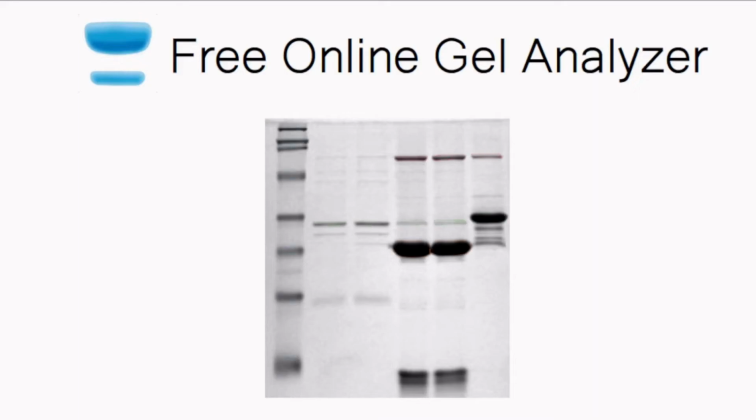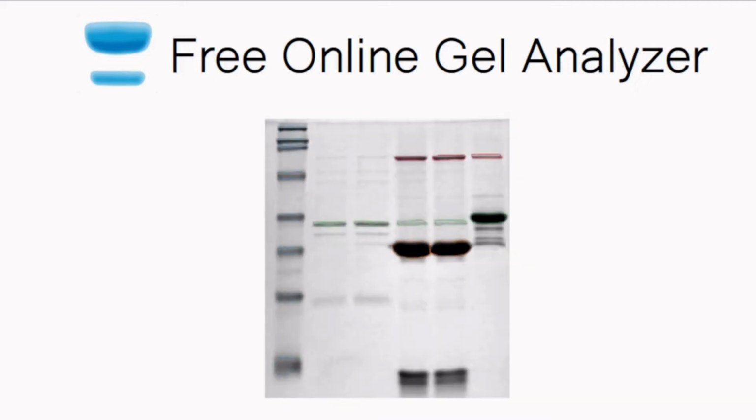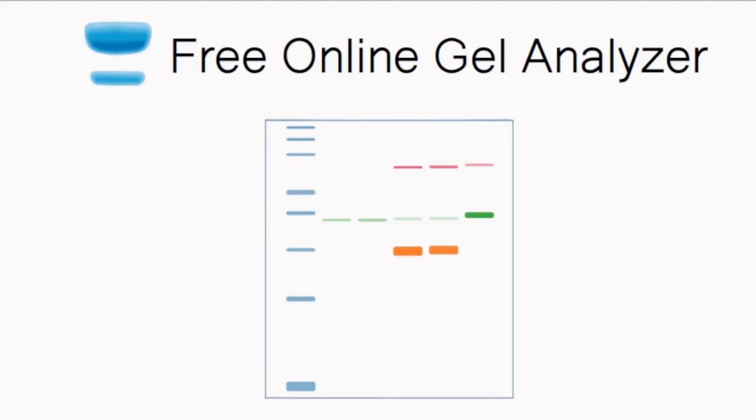Hello and welcome to this quick tutorial for the free online gel analyzer app, where I'm going to transform an SDS-PAGE image into an interactive gel figure that will easily show you band intensities, areas, molecular weights, and more. First, I'll show you what the end result looks like in the app, then we'll recreate it step by step.